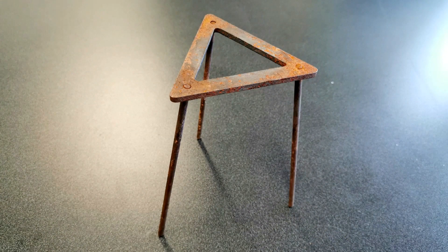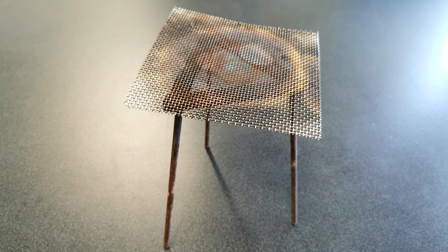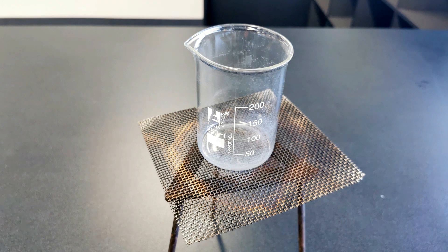This is a tripod — named funnily enough for its three legs. You would put the tripod over the top of your Bunsen and then place a gauze mat on top of it. This is great for holding your beaker when you want to heat up the solution, with the Bunsen sitting underneath heating through the gauze mat. The job of the gauze mat is not to stop the beaker falling through — it's actually to spread the heat more evenly, distributing it so the beaker doesn't crack from being heated strongly in one place.